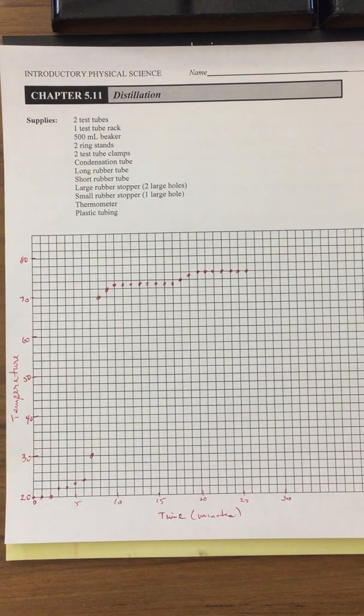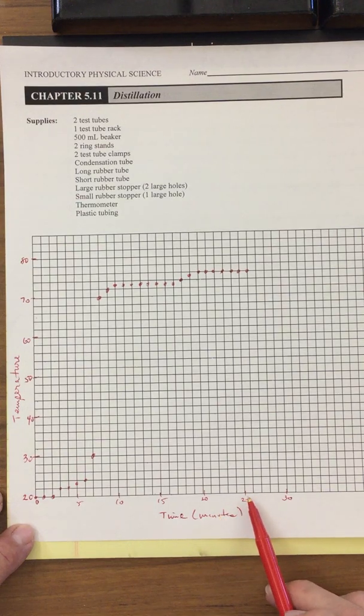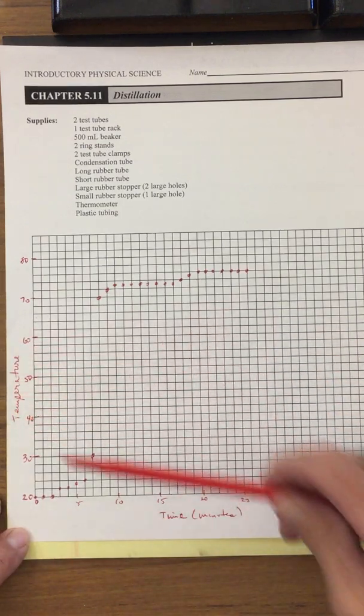If you can go ahead and copy this material, and now we're going to analyze it. So what we have on the x-axis is our time. So we can label the axis with time, and of course this is going to be taken in minutes. We went to about 26 minutes during this experiment, and on the y-axis is going to be temperature.